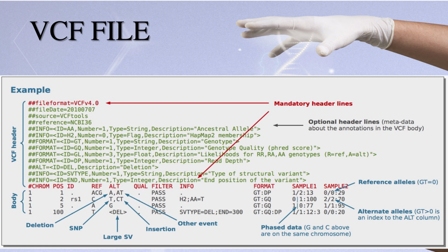These lines delineate the format and specifics of the particular VCF file. The information encapsulated in these lines may encompass details about the sequencing process, variant calling software, or the reference genome employed for variant determination. As reiterated earlier, these lines, characteristic of metadata, commence with a prefix of two pound symbols, signifying their distinct role in outlining crucial file characteristics. The initial line in this section designates the file format, explicitly indicating the format of the file. Following this, there are several additional lines containing diverse information.